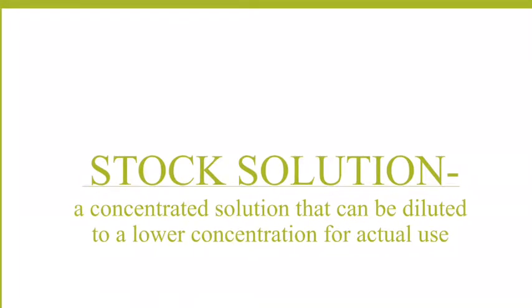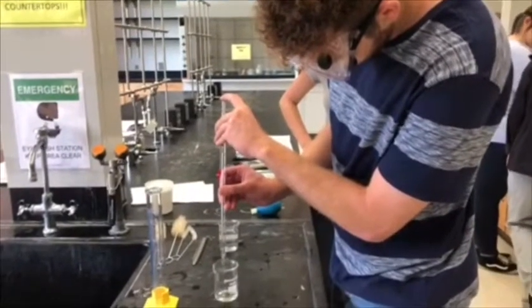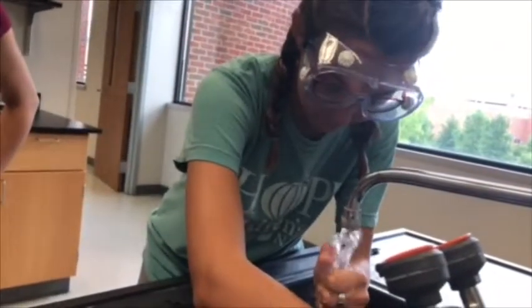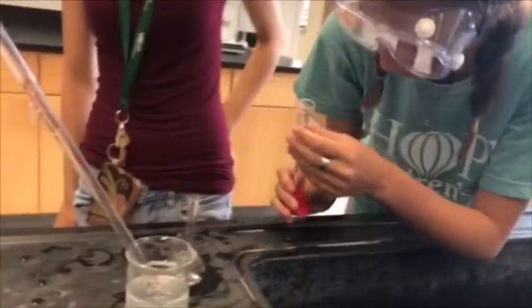We then used a 10 milliliter pipette to transfer some of the sugar stock into a beaker and diluted the solution by adding water. We filled the 10 milliliter graduated pipette with stock solution and recorded the amount filled as the initial volume. We then released some of the stock solution into a 25 milliliter flask, recording the amount of stock left in the pipette as the final volume.